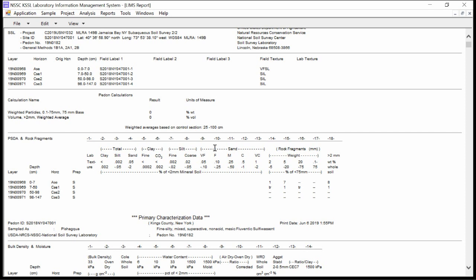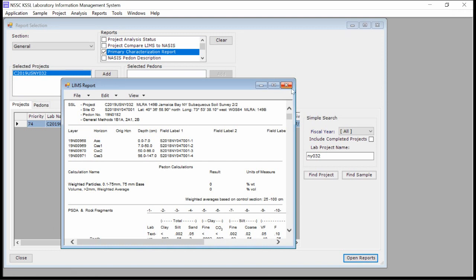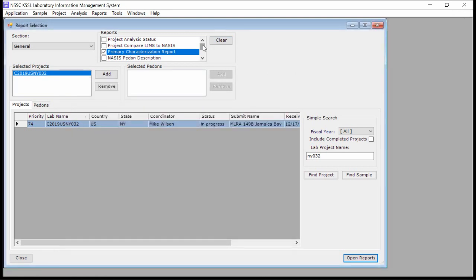Are there any other reports that will give us tabular data rather than HTML? There are. The question was, are there any reports that output the data in a tabular format? That's a request that we've been getting a lot more. So Rick has worked up a couple of provisional reports that download as CSV files. We're still kind of figuring these out, working out the kinks to make them work as intended. Why don't you show one of those? I will surely show one of these.